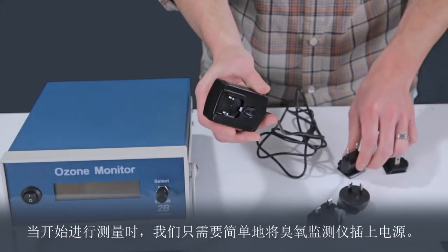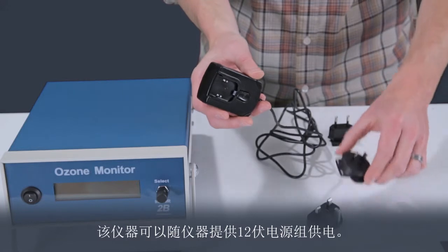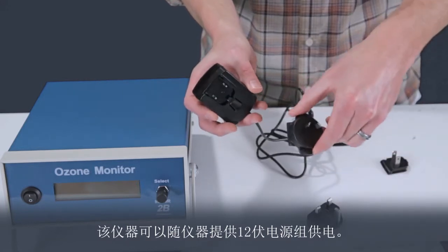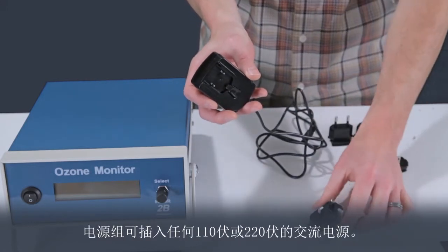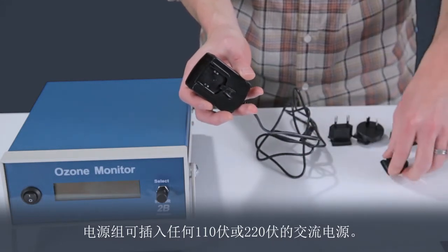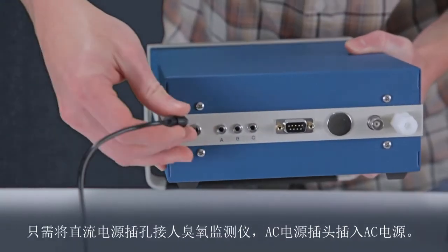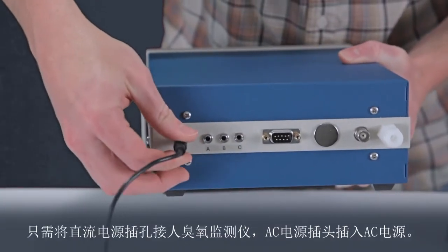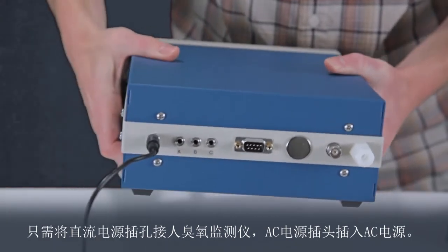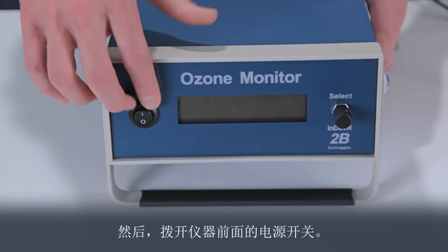To start making measurements, we simply need to power up the ozone monitor. The instrument may be powered by the 12-volt power pack supplied with the instrument. The power pack may be plugged into any 110-volt or 220-volt AC source. The appropriate plug was supplied for your country, but other plugs are available. Simply plug the DC power jack into the ozone monitor and the AC power plug into an AC source, then flip on the power switch on the front of the instrument.